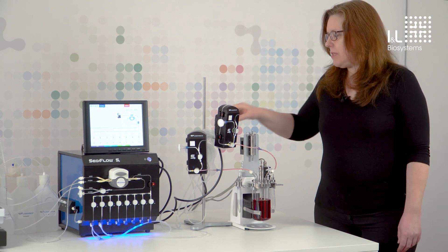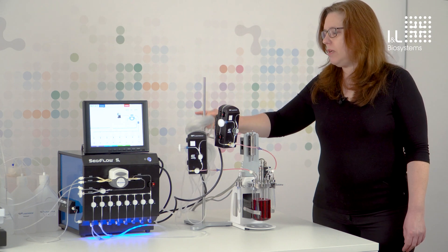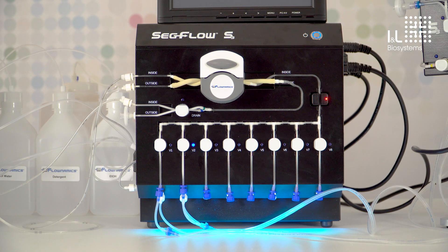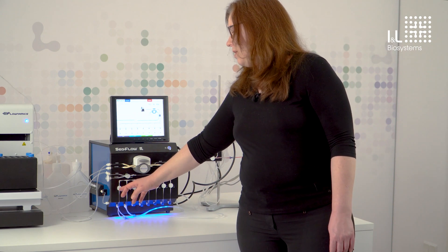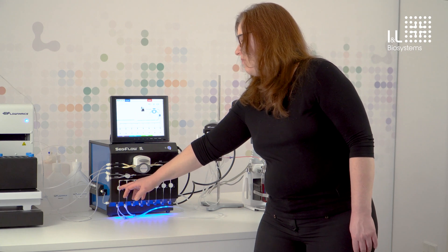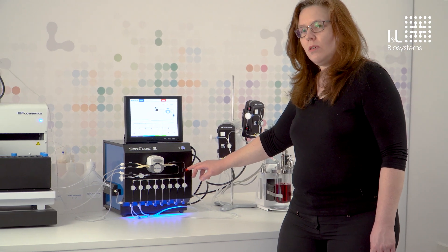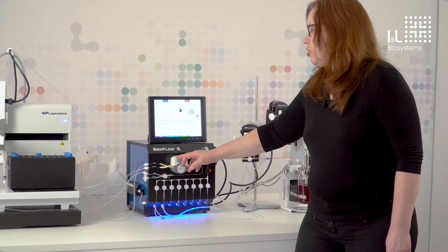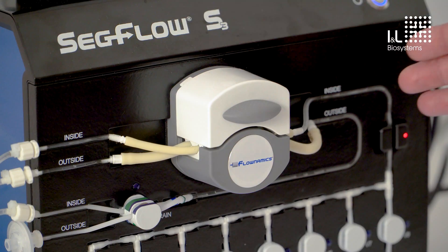The sample then flows over three or seven meters distance through the tube here towards the main unit, the SecFlow S3. Here we have this fluidic line which we have connected to the first fermenter via the luer lock connection. Here we have another clamping valve via this tube here to this sensor where it is recognized.